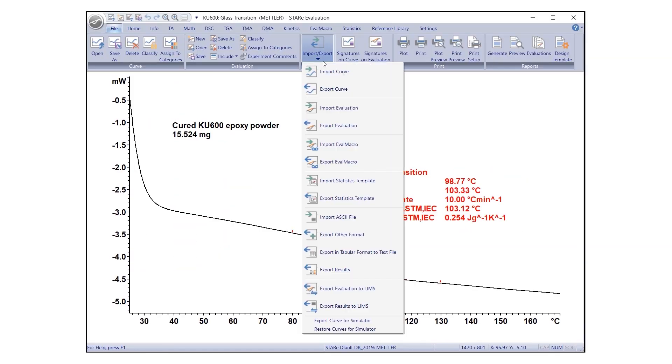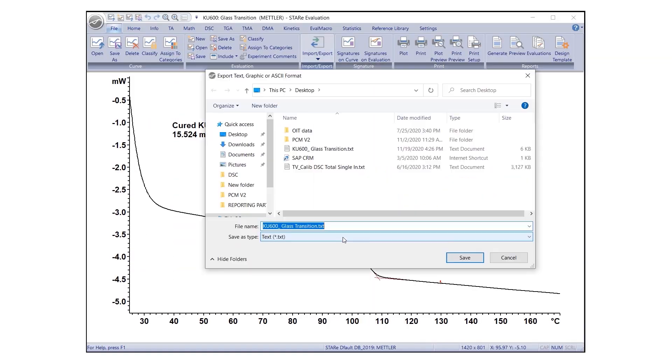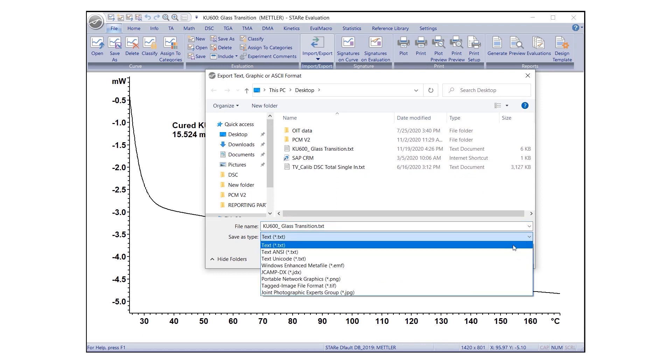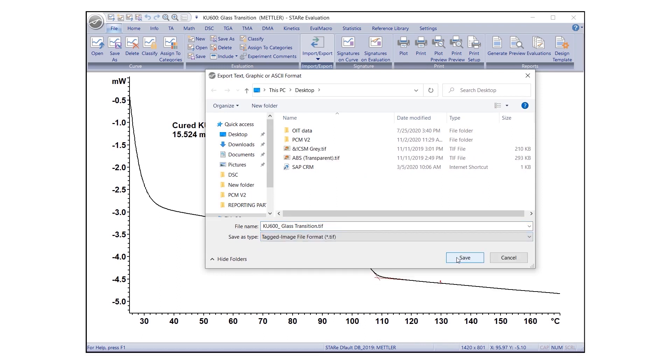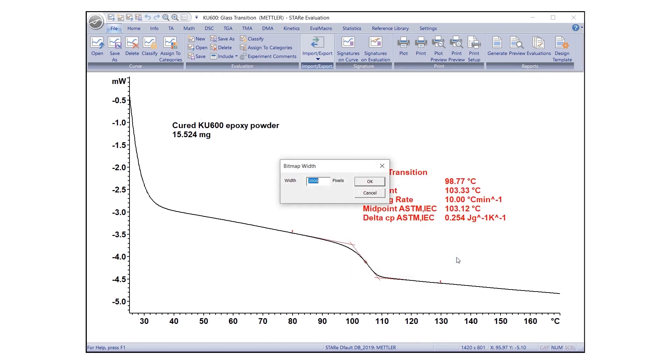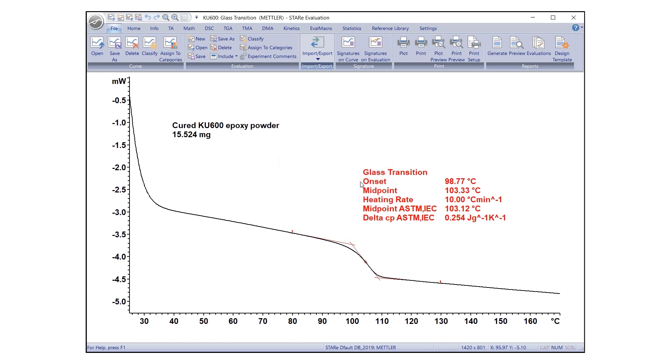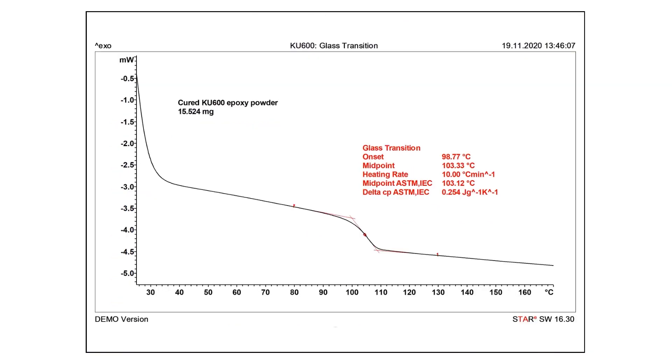If .tif format is selected, a Bitmap Width dialog box will appear. Enter the desired width of the bitmap here. This setting can be saved by clicking Save Settings. After clicking on Save, the data or graphic in the current evaluation window is exported and saved in the specified file in a .tif format.